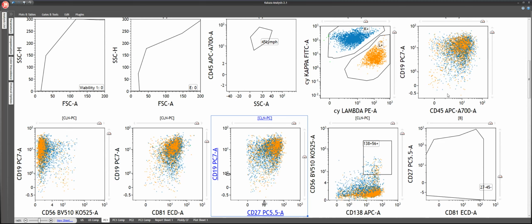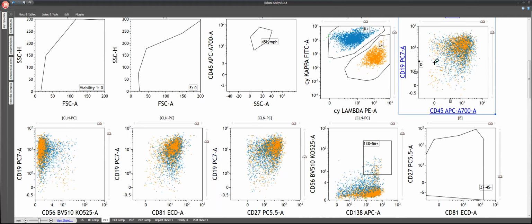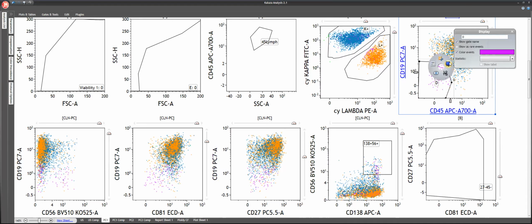Now, because this region is where the most suspicious abnormal plasma cells fall, in more than 95% of cases, we start from here, with CD19 negative and CD45 negative. Let's put a gate here. A little broader gate. Here we started, which we can label. In fact, if you look carefully, some of the cells are coming in from this border. So some of the cells may not be true plasma cells. So we probably have to readjust this gate to exclude these cells coming from this border. We can do that later, but let's find out first.